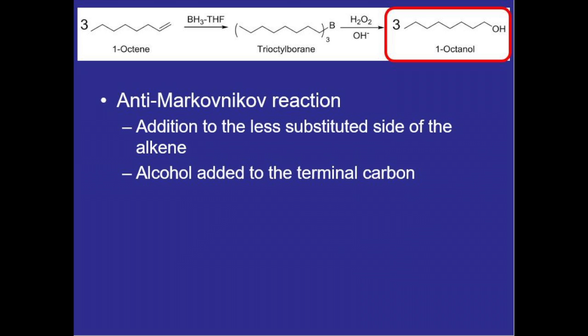But in our reaction, we are placing the alcohol on the terminal carbon, and that just has to do with how the borane interacts with the alkene and then gets substituted with the hydrogen peroxide.